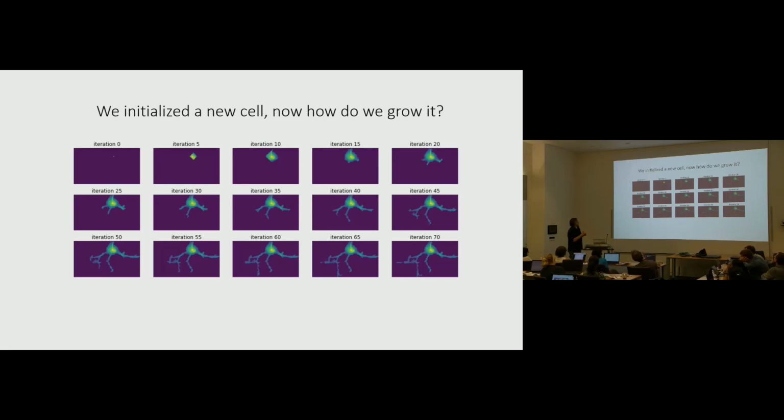It keeps expanding for as long as the pixels that it adds are similar to the pixels that were already there. Basically, that's the idea. Now, I should say, it's not just ad hoc. It's not that we just thought, oh, we should just keep adding pixels that were similar. It's directly minimizing that cost function. But it turns out, to minimize the cost function, you more or less are correlating new pixels around with the pixels inside of your cell. So it's also a fairly intuitive process. And if you had something like axons or dendrites, it would just grow from someplace and grow as much as it can.